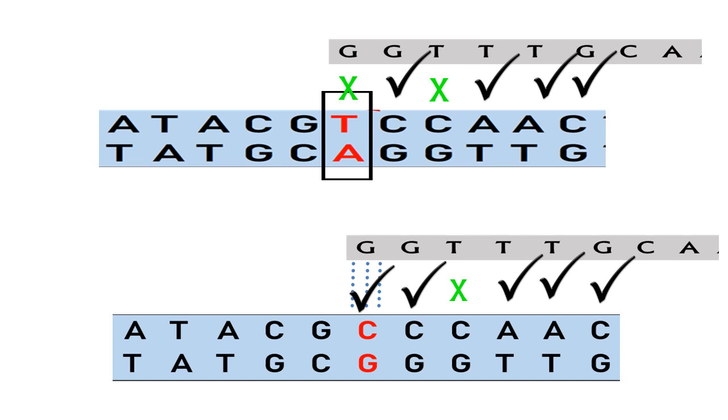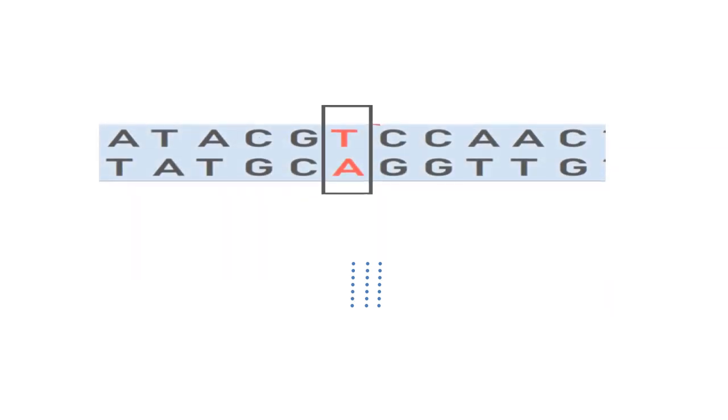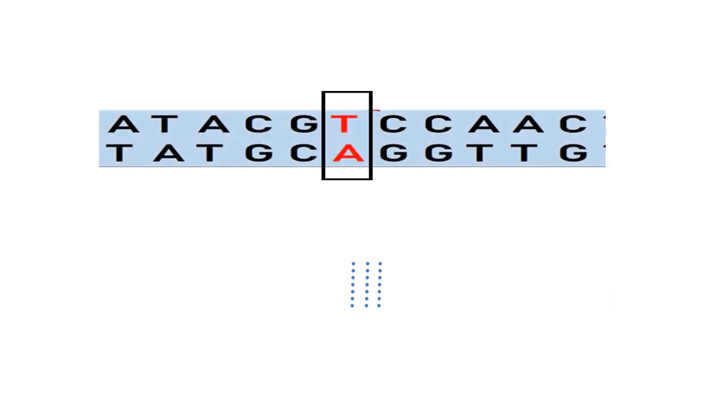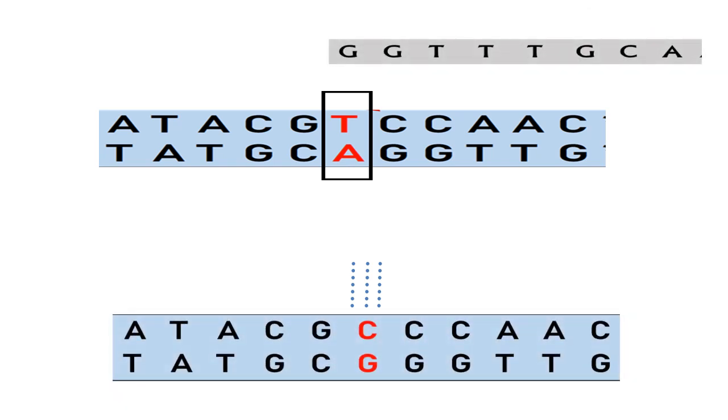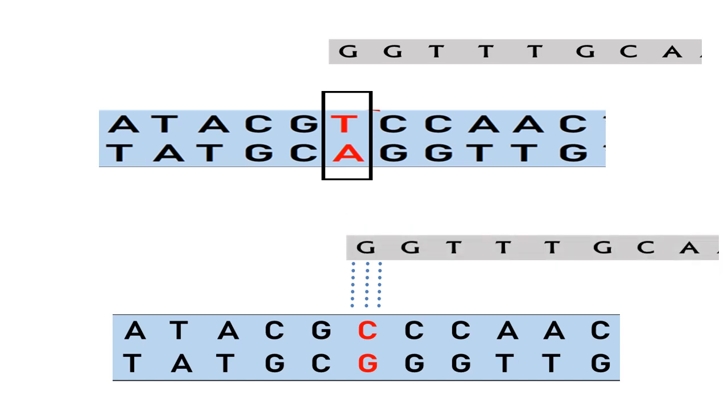So this figure shows us how a primer works and how a primer does not work. The first primer will not work, and in the second figure the primer will work. The second primer will form a product and the first will not form a product. This is the DNA sequence, the primer, and that is another DNA sequence. The primer tries to get attached.